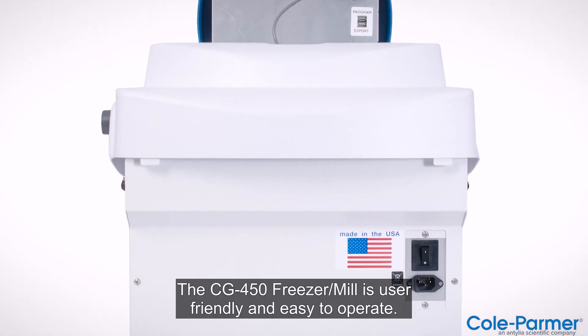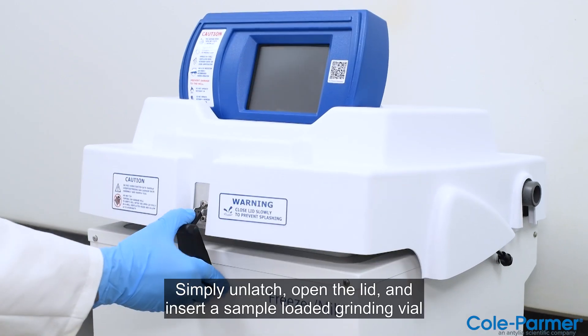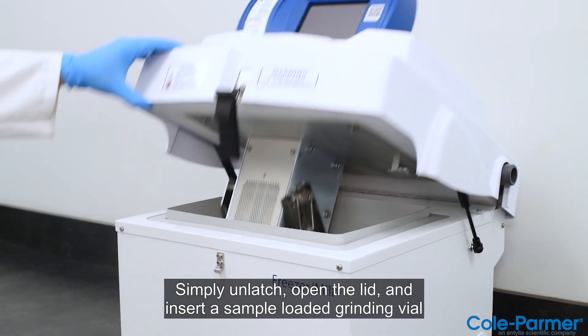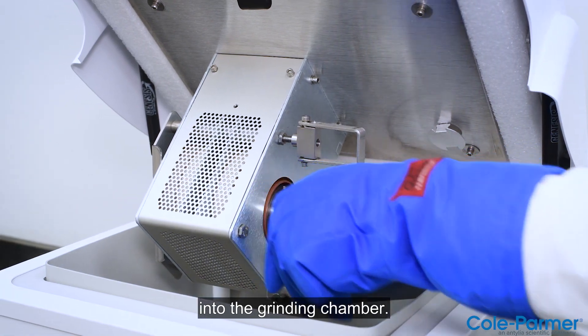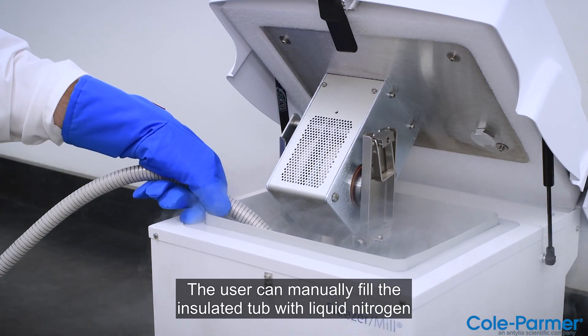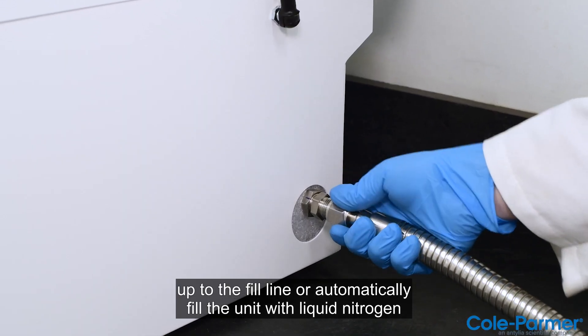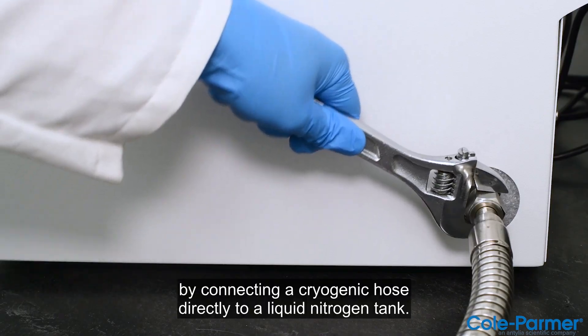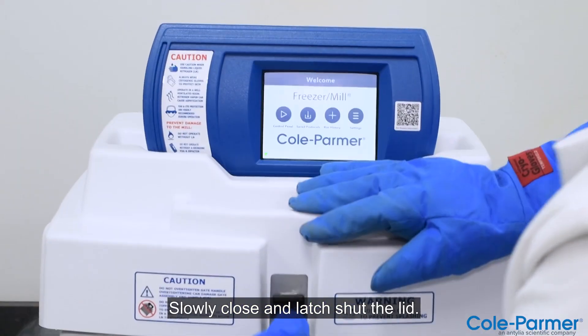The CG450 Freezer Mill is user-friendly and easy to operate. Simply unlatch, open the lid, and insert a sample-loaded grinding vial into the grinding chamber. The user can manually fill the insulated tub with liquid nitrogen up to the fill line, or automatically fill the unit with liquid nitrogen by connecting a cryogenic hose directly to a liquid nitrogen tank.